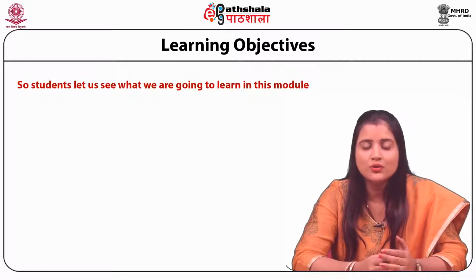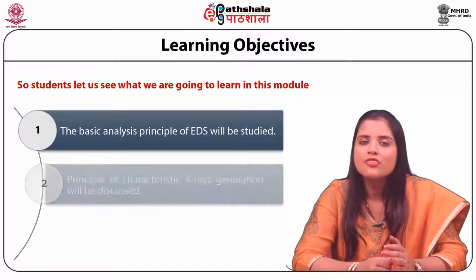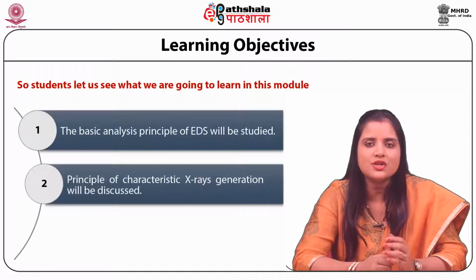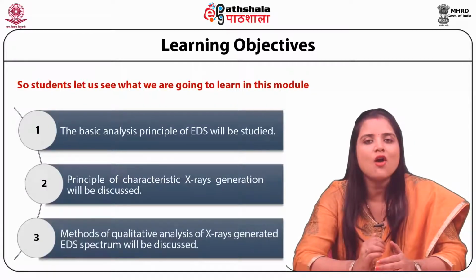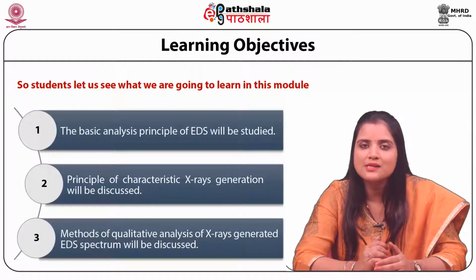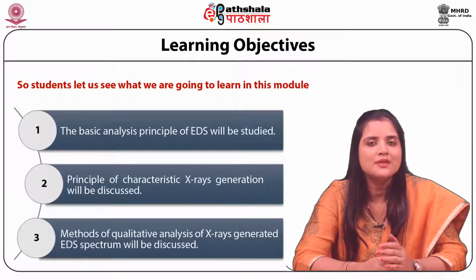In this module, the basic analysis principles of EDS will be studied. Secondly, the principle of characteristic X-rays generation will be discussed. Then, the methods of qualitative analysis of the X-rays generated EDS spectrum will be discussed.